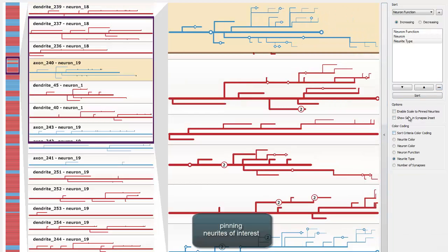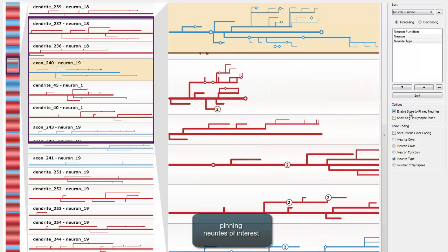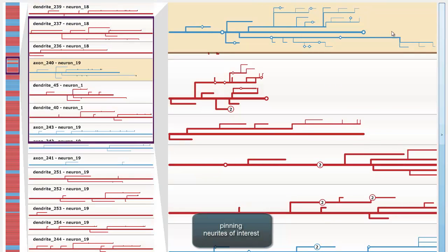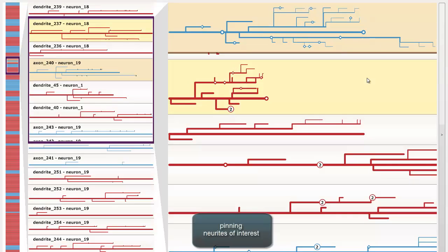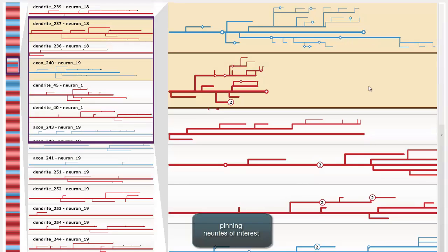To analyze the length and branching patterns of neurites, we support relative scaling of all structures in relation to the pinned neurite. We also allow multiple neurites to be pinned to the workspace.